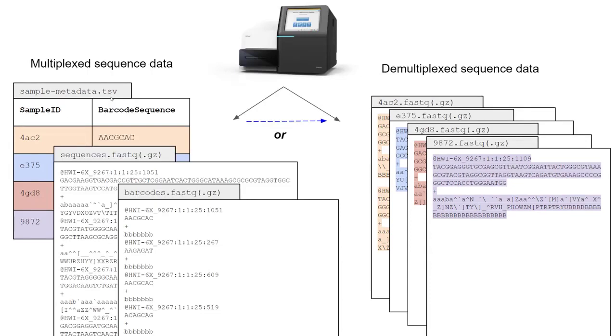Now, depending on the sequencing facility where your data came from, you may receive your data in either multiplexed form, such as in our example here, or demultiplexed. So, if you receive multiplexed data, then of course you will need to demultiplex your reads.